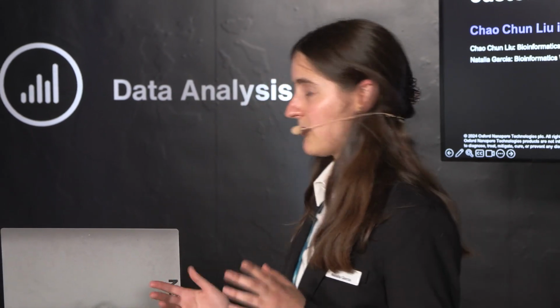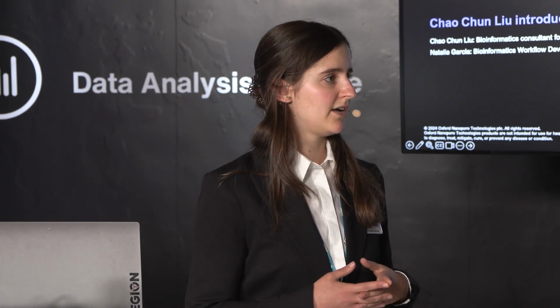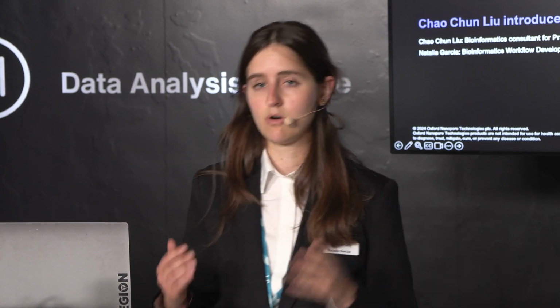I'm Natalia, I'm a workflow developer in the EPI2ME team, and I hope that you have already heard about it, but if not, you are in the right place, because I'm just going to introduce briefly the app, showing you the new exciting updates, coming updates, and then I will just introduce our guest, Jimmy, that will show you how to make the most of it by running your own workflows.